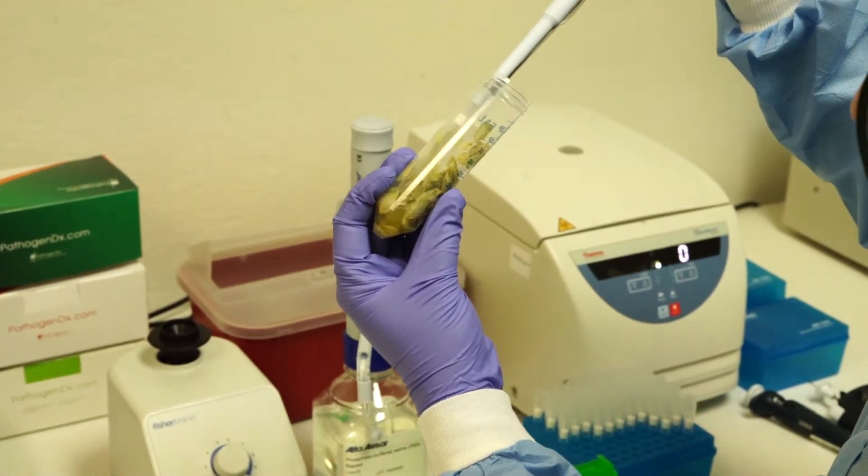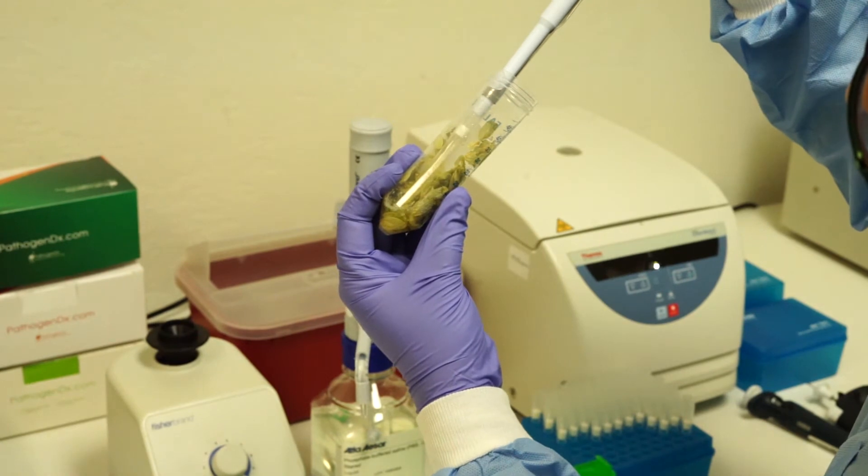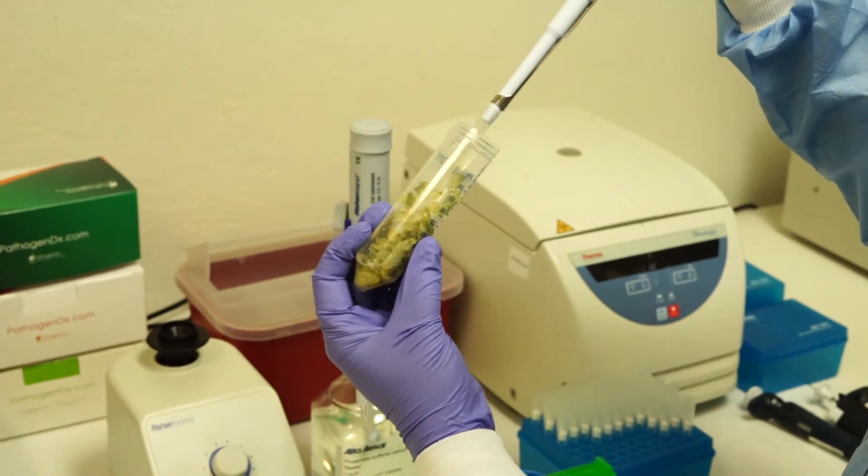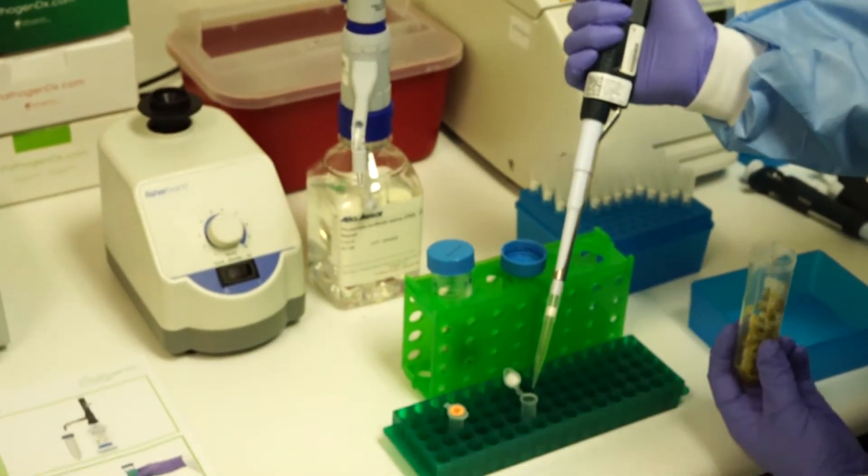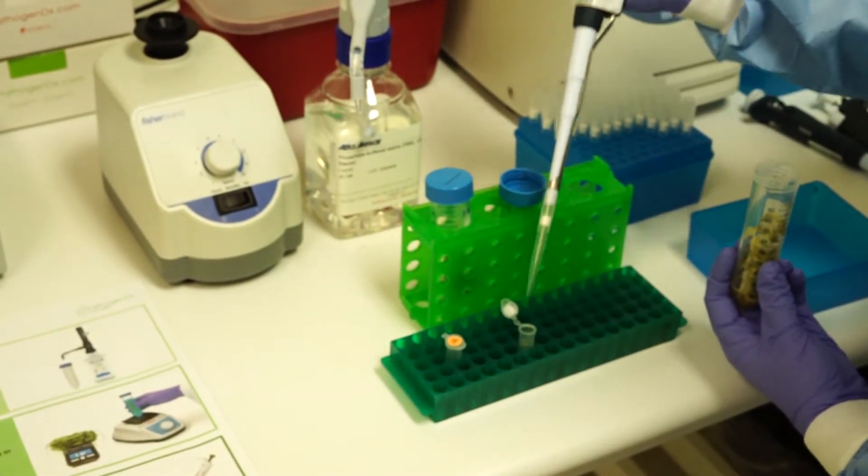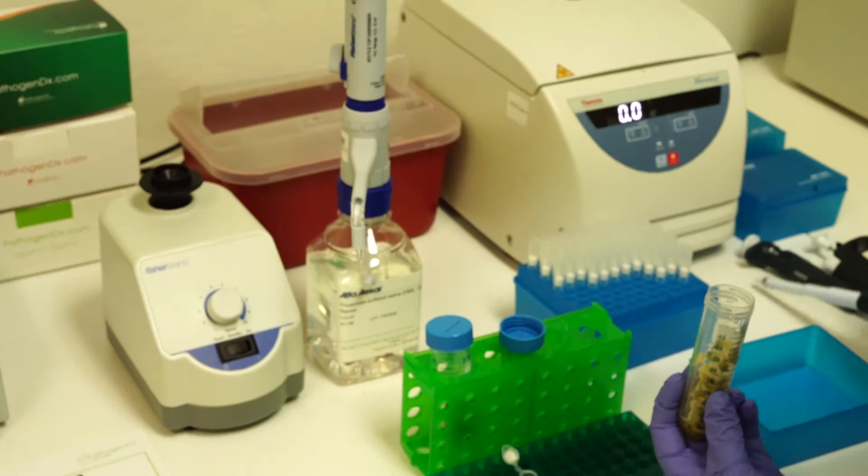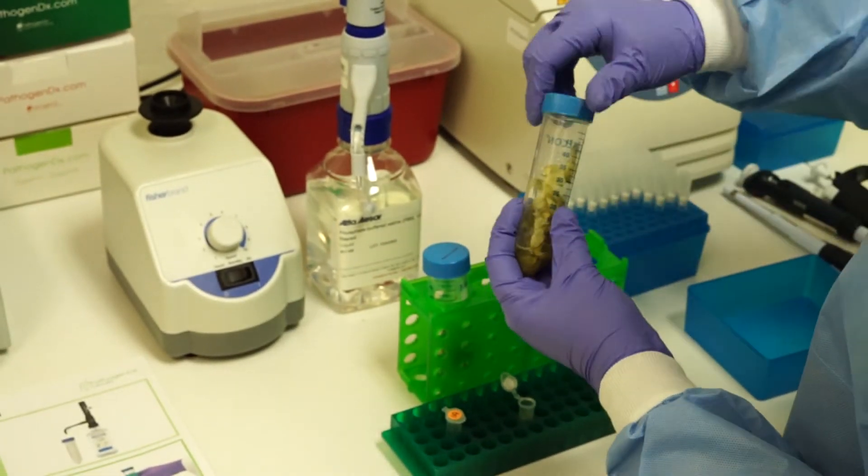It may be necessary to push the plant material out of the way using the pipetter. Once you have obtained 1 ml, transfer to the 1.5 ml tube and make sure to change tips between each sample to avoid cross-contamination.